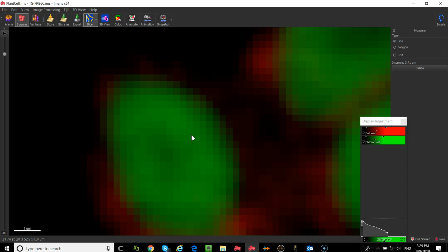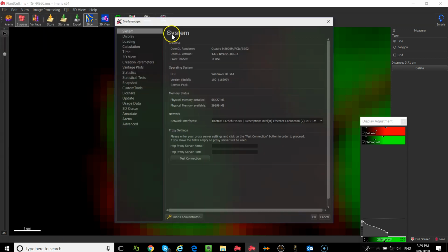So what we do with the surface is we apply smoothing to basically make the surface smooth like the edge of that structure really should be. Okay? If we take smoothing off, you'll get a jagged edge. You can take smoothing off, and sometimes that's necessary if you're working with very, very small structures, because the value that we use, so I'm going to put the interpolation back on.